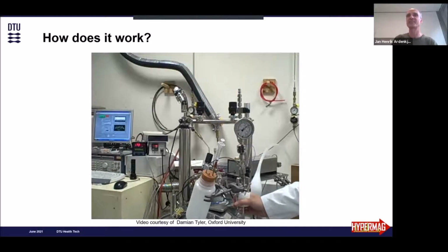This is the more recent polarizers that I showed on the previous slide. The same experiment becomes a little boring because now there's no running and no steaming and no very rapid manual procedures because it's all been automated.